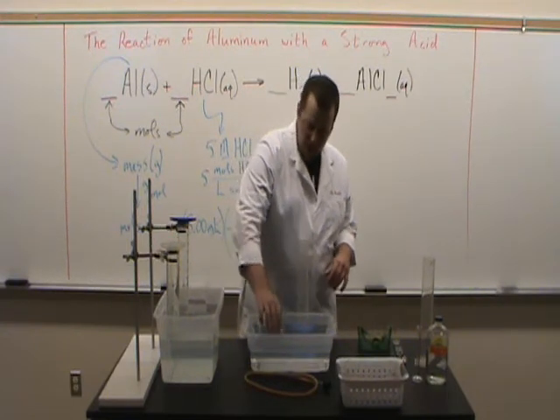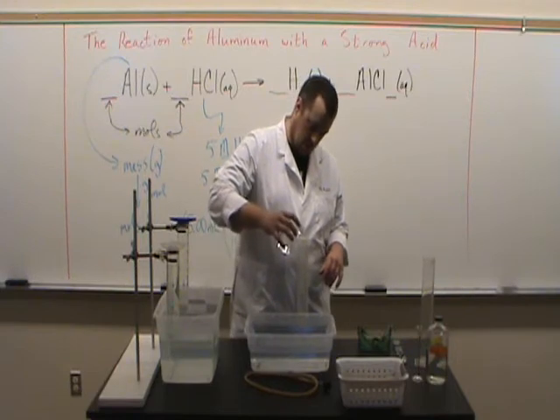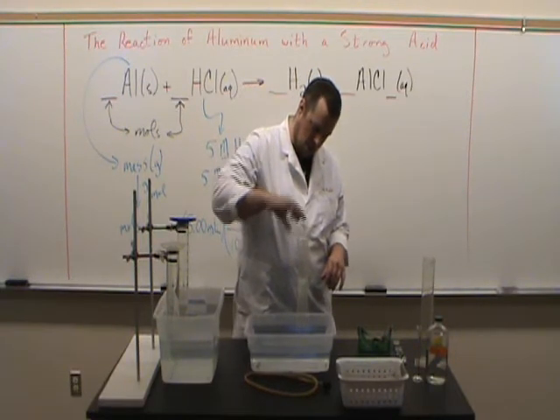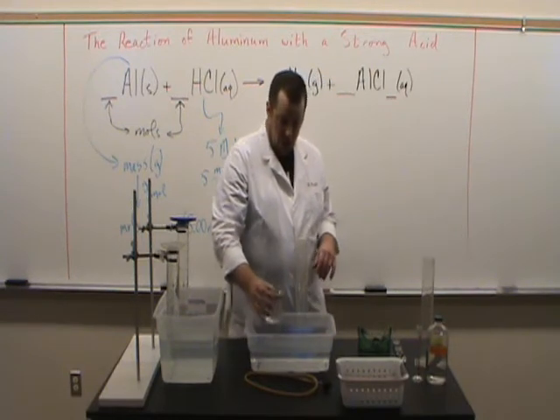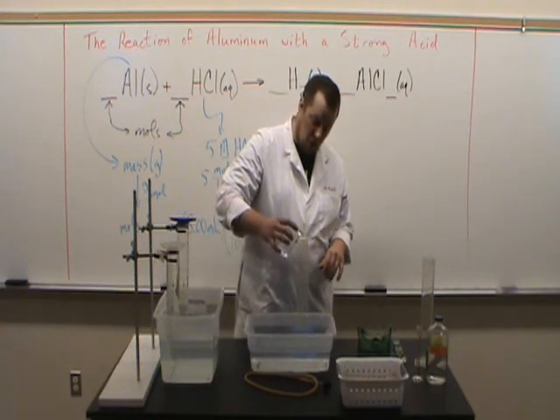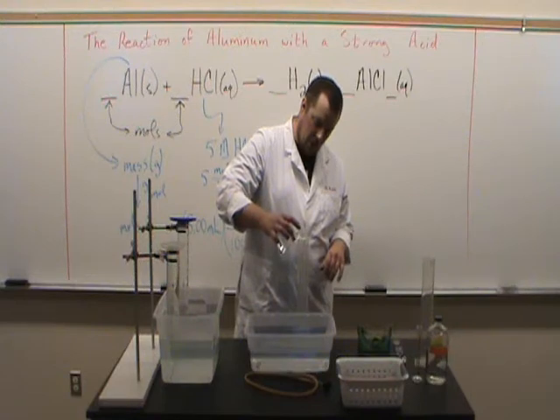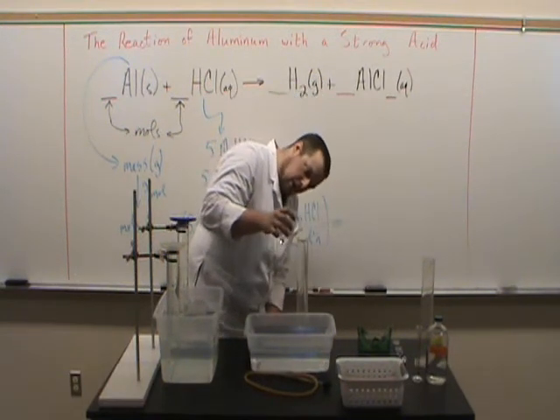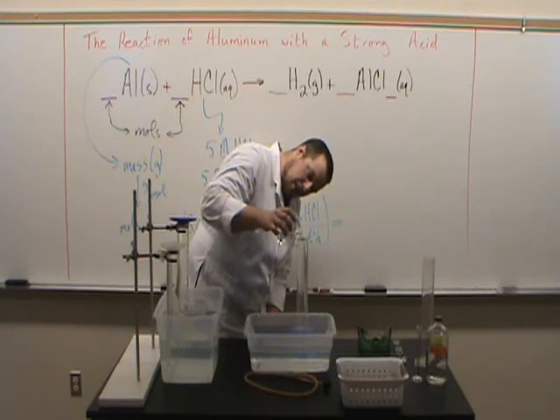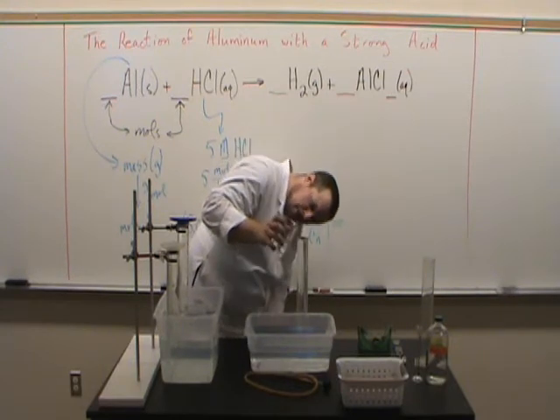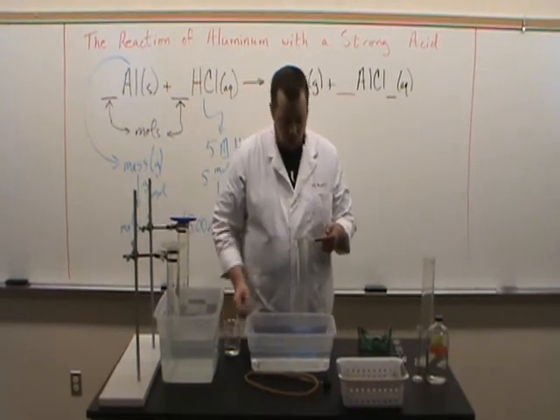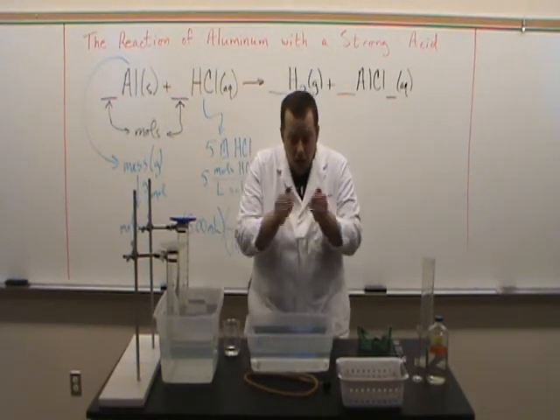So if I take this graduated cylinder and I fill it up with water, one of the interesting and useful properties of water that we're going to exploit is surface tension. So if you fill it up, you can actually fill up the cylinder past the top of the container. Right? Water heaps up a little bit.